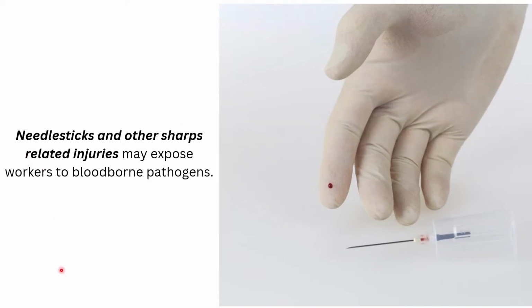This is very true. Needle sticks and other sharps related injuries may expose workers to blood-borne pathogens. Aside from bacterial infections, you could also acquire human immunodeficiency virus or HIV that could probably lead to AIDS. So, God forbid. Also, you could get hepatitis B virus out of this, and also hepatitis C virus infection. So, as much as possible, you have to be extra cautious inside the laboratory.